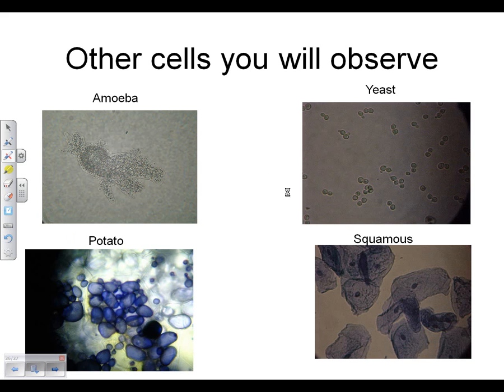Also, the other things we're going to be looking at are amoeba, and so you'll be watching them stream pseudopods around the microscope slide or screen if you're looking at the TV, and you'll see all these cool little things just sort of streaming along. If, as I said, you had it under the light too long, you'll see one of the cell walls burst, and you'll see the stuff stream out of them. So that's when you'll know you've had them under the light a little bit too long.